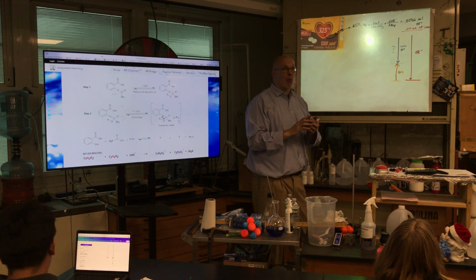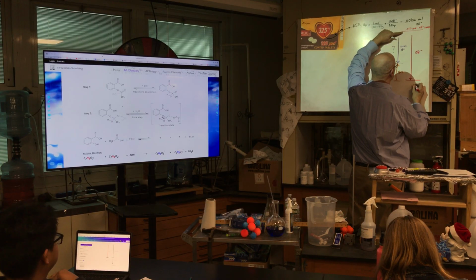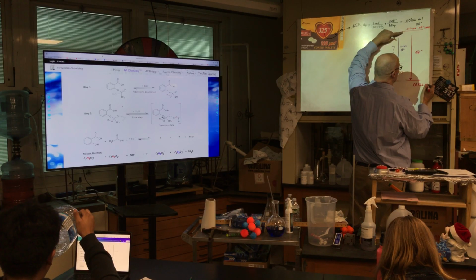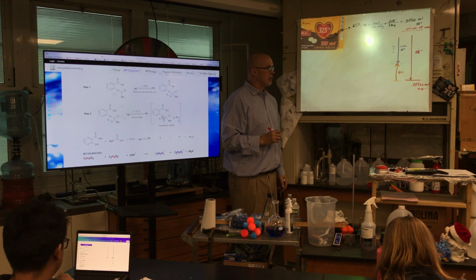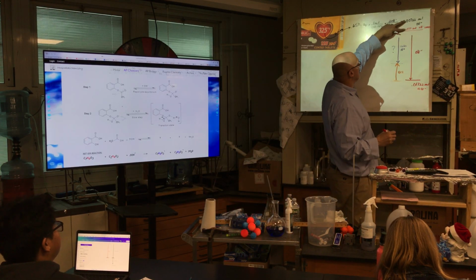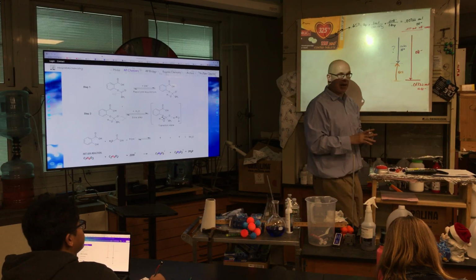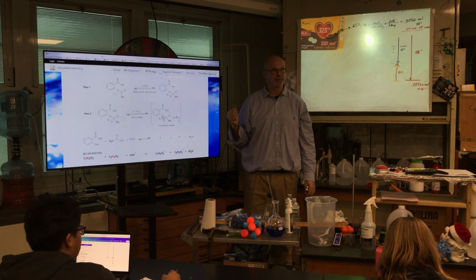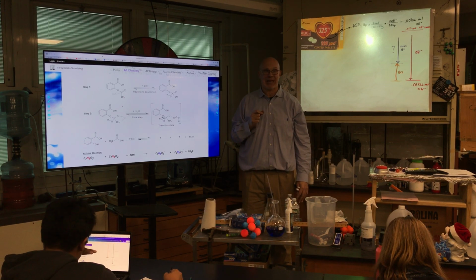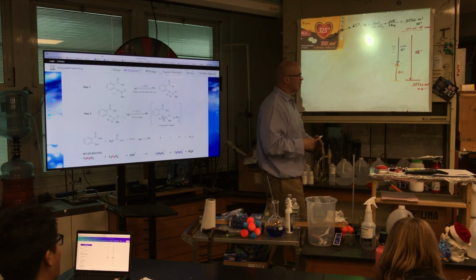And what did we get? This is important. We got a projected total amount of hydroxide moles. It was 0.01722 moles of hydroxide. Is everybody with me? Good. I added a projected excess. This is a back titration. We're going to titrate the excess. I need the excess by Le Chatelier's principle to drive this to completion, to find every piece of aspirin in my tablet. So we crush it, we add excess, that's why back titrations are used. Is everybody with me with this number?